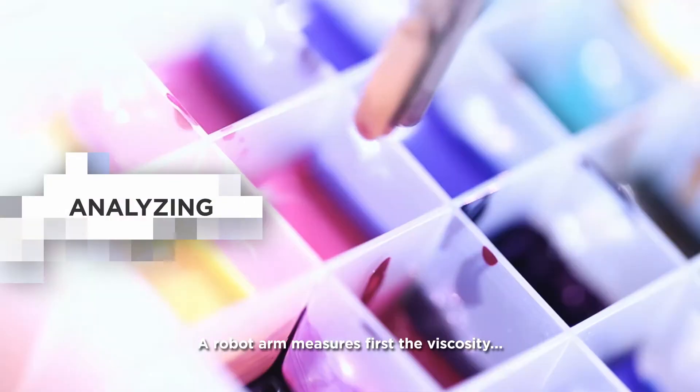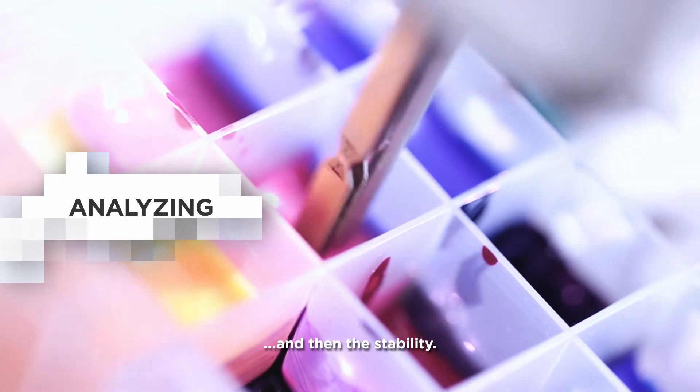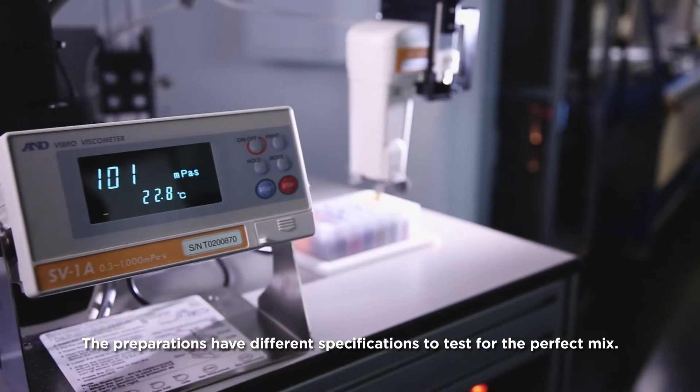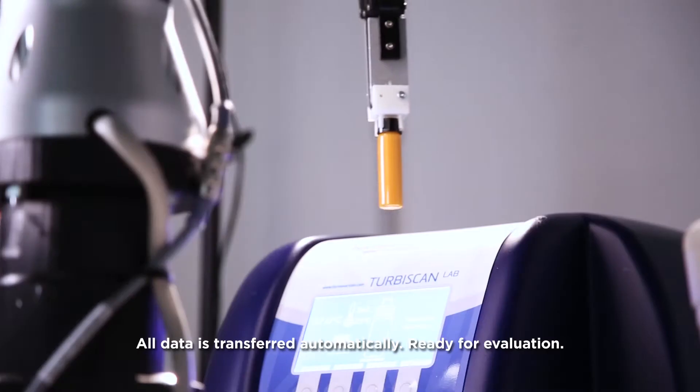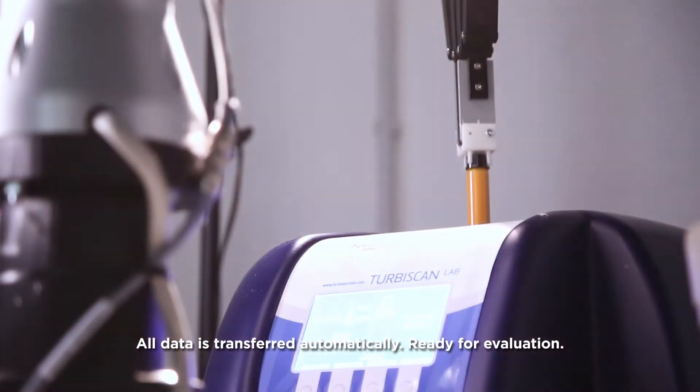A robot arm measures first the viscosity and then the stability. The preparations have different specifications to test for the perfect mix. All data is transferred automatically, ready for evaluation.